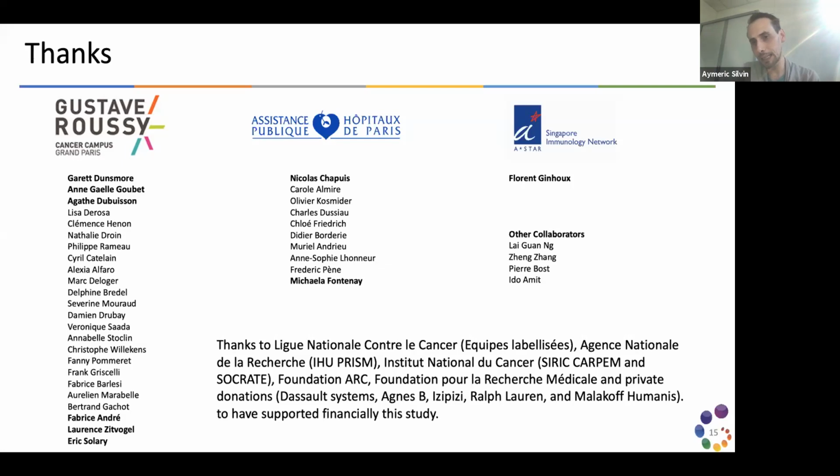In my case, it was PBMC. I used beads. I think where you have to be careful is when you use cells that come from a tissue that has been digested. Maybe it's better to do your monocolor on cells and not on beads for this kind of tissue, or at least once to make sure. But otherwise, for PBMC, the beads worked really fine. I just checked after and modified the bead, but it was nothing drastic.